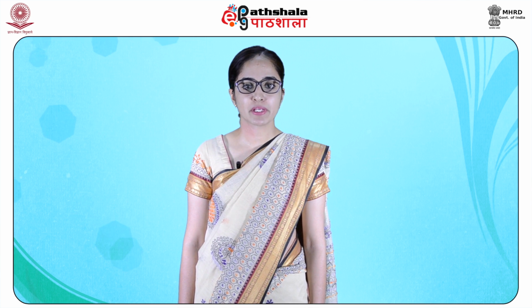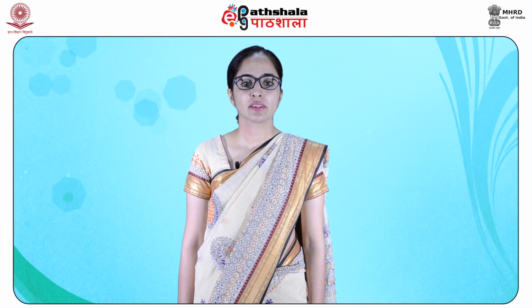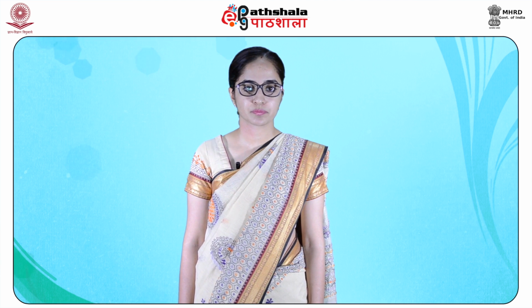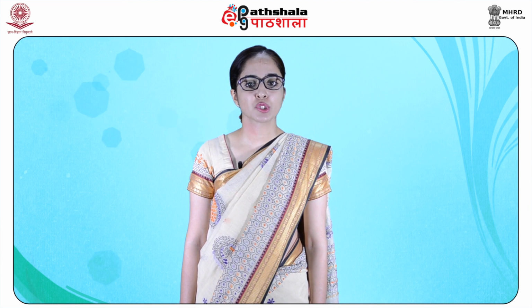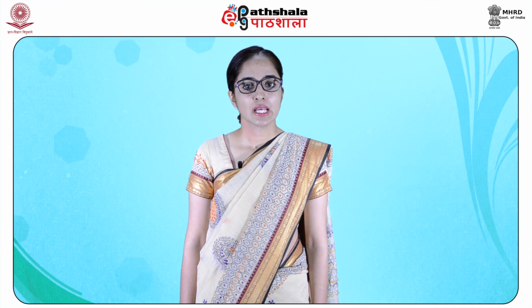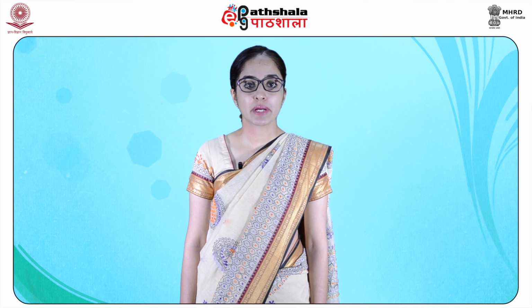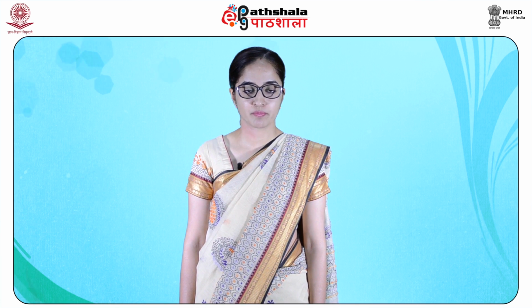The value of coupling constant J remains constant, and hence the value of delta nu divided by J will increase on increasing the field strength. Therefore, at high field strength, most proton NMR spectra become first order. It is important here, students, to notice that high field NMR instruments give better resolution and relatively easily interpretable spectra.